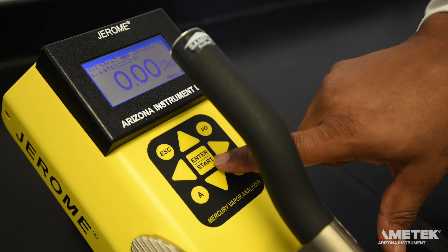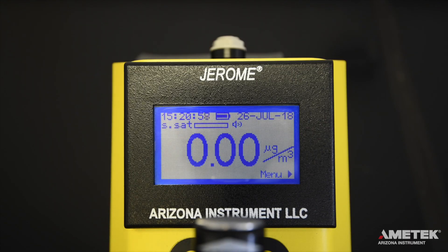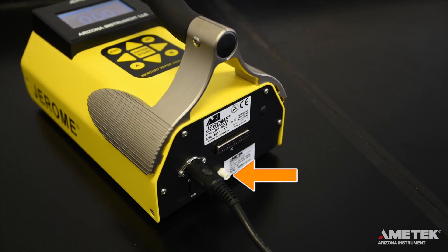To take a sample, you can either press the Enter button on the keypad or the silver sample button at the tip of the handle. At the end of the sampling cycle, the reading will appear on the screen in micrograms per meter cubed or milligrams per meter cubed. It is important that you do not obstruct the intake or exhaust ports, and do not allow the probe or the intake to draw in liquids. At the end of a sampling day, or if the sensor becomes saturated, perform a sensor regeneration cycle.